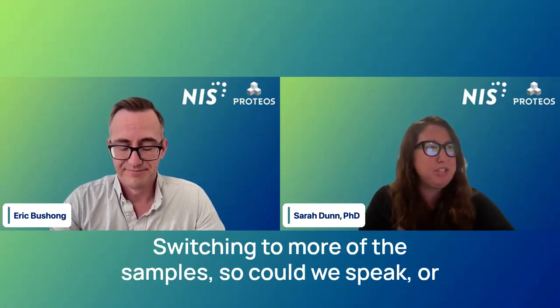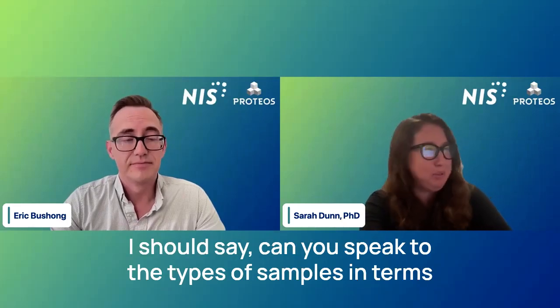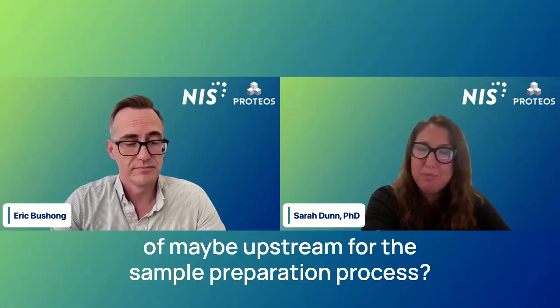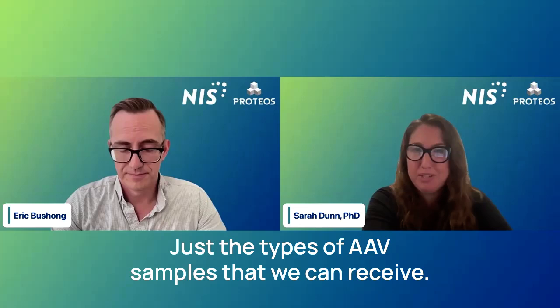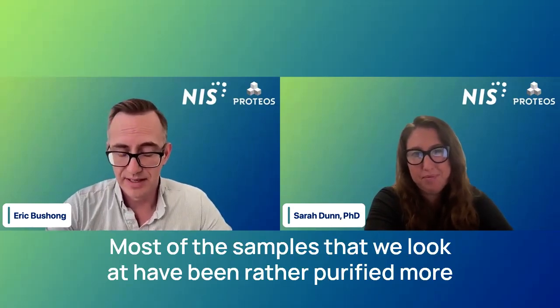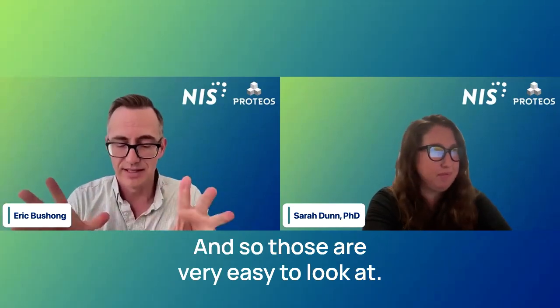Thank you. Switching to more of the samples. Can you speak to the types of samples in terms of maybe upstream for the sample preparation process? So just the types of AAV samples that we can receive. Most of the samples that we look at have been rather purified, more very downstream and in product. And so those are very easy to look at.